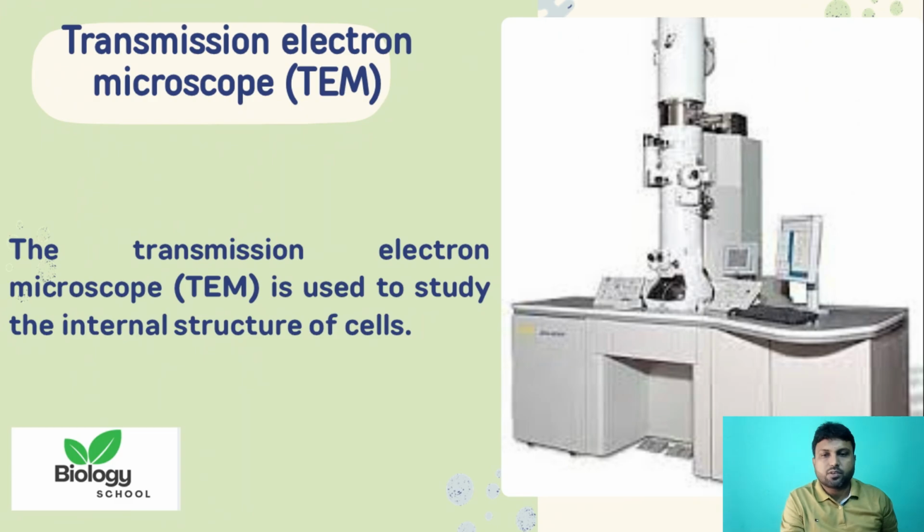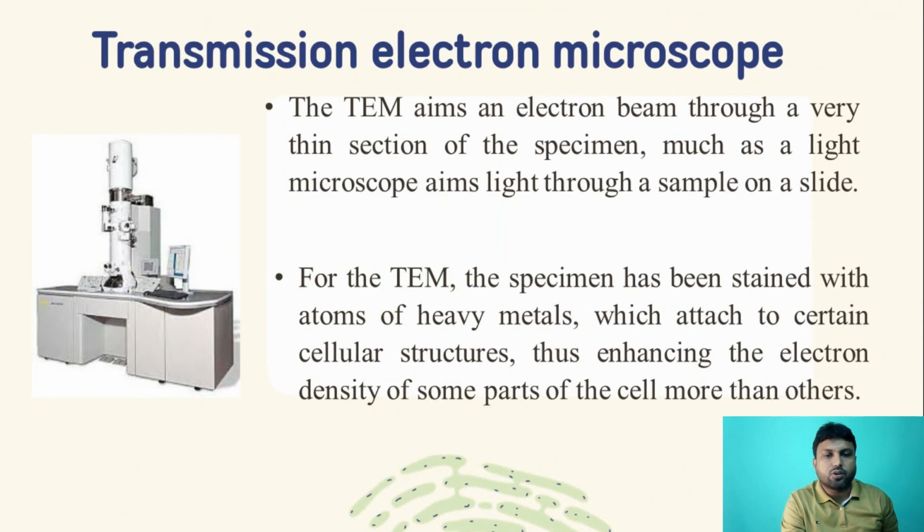And now the transmission electron microscope. The transmission electron microscope is used to study the internal structure of cells. It aims an electron beam through a very thin section of the specimen, much as a light microscope aims light through a sample on a slide.